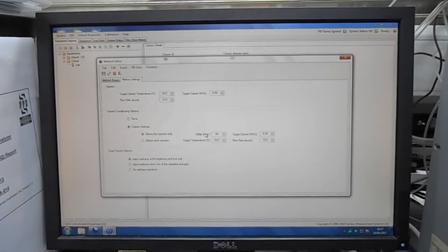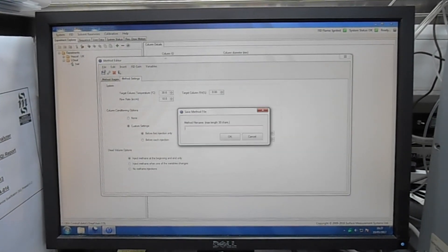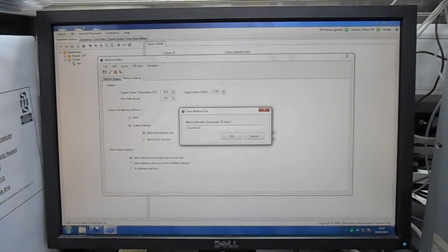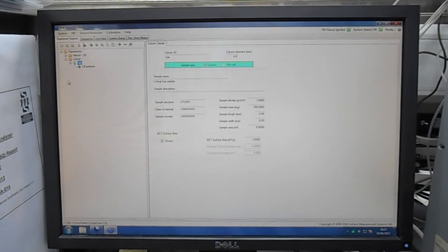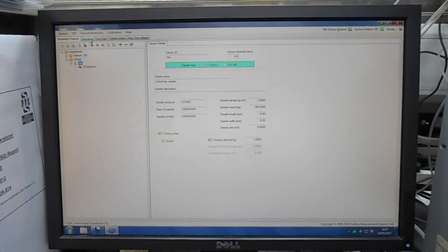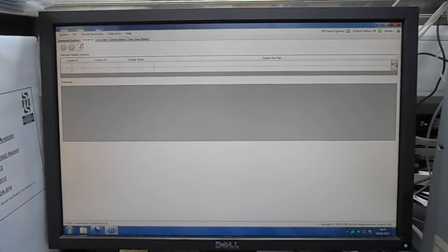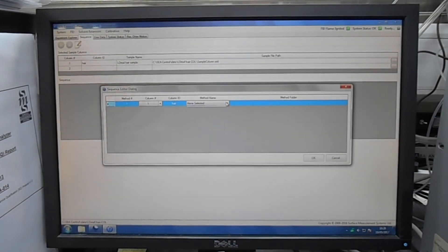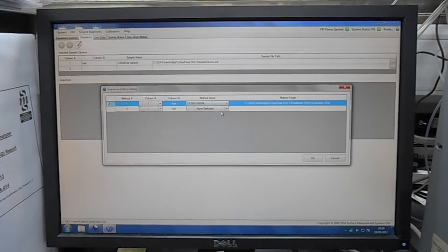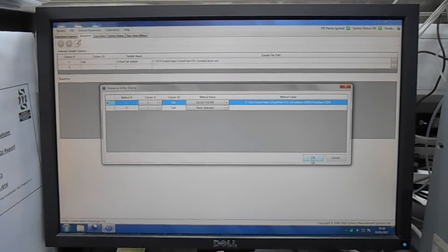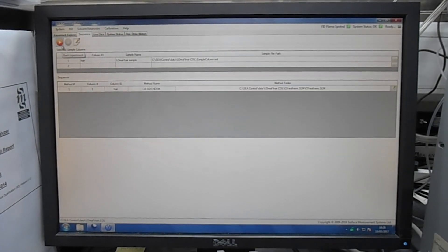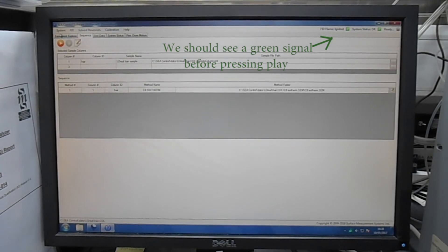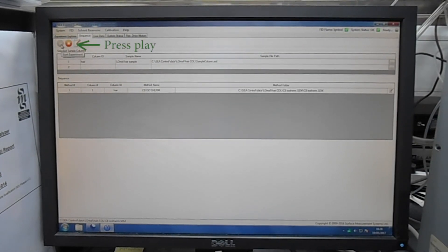Once this is done I can actually introduce custom settings for the pre-treatment of the sample that allows you to remove any potential sorbates that are stuck on the surface of the sample. Then I can load the method for each column or each sample and once the methods are loaded I can start the method by pressing play on the software and start collecting data for my experiment.